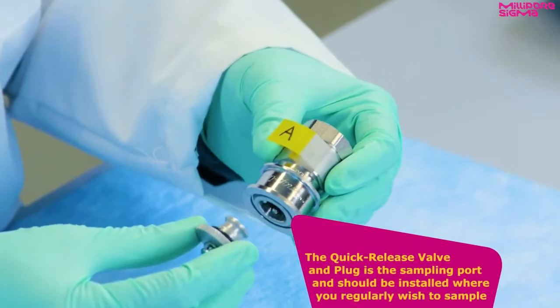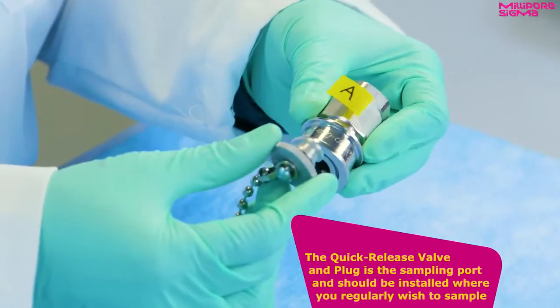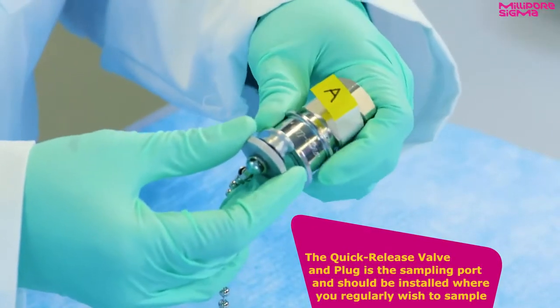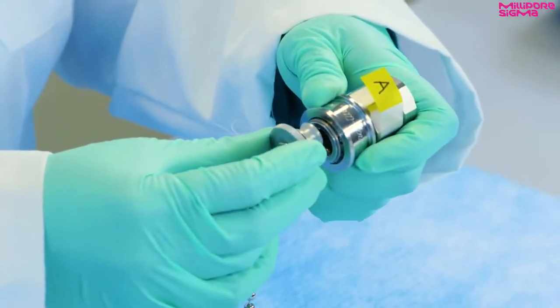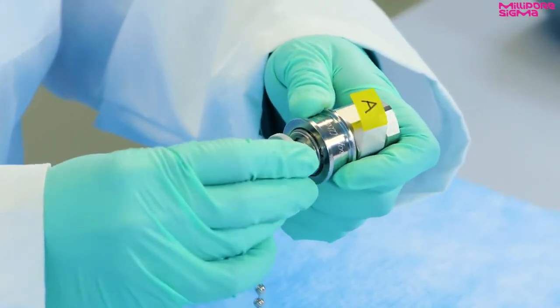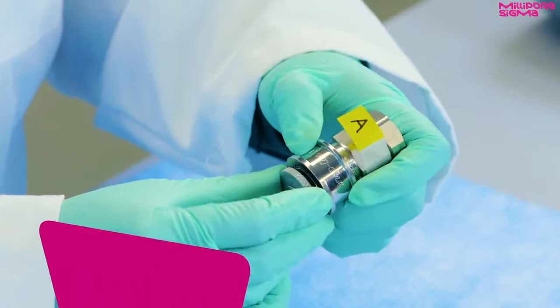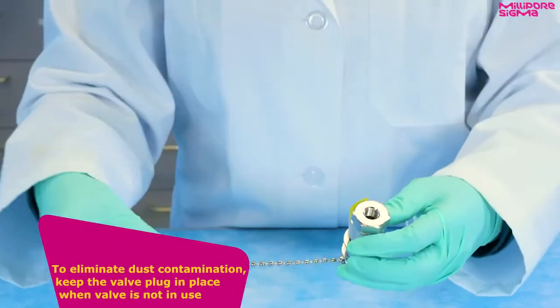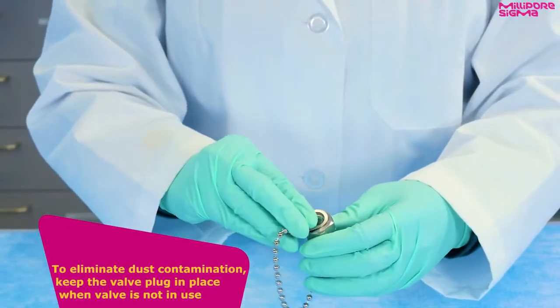The quick-release valve and plug is the sampling port and should be installed where you regularly wish to sample. This valve will not allow liquid to flow until it is engaged with the sampler assembly during sampling. To eliminate dust contamination, keep the valve plug in place when the valve is not in use.